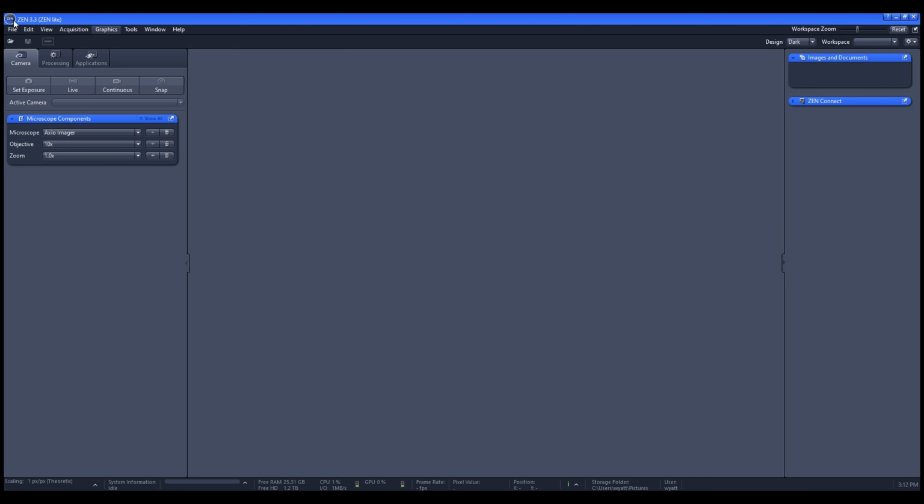As you can see, I'm now in this software, and I'm going to use it to show you some really cool thin section scans from some of my rock samples. Over the summer I collected some mafic samples like basalts, which are extrusive volcanic rocks from a volcanic field in Montana. I collected these samples for not only geochemistry and isotopes, but also some thin section analysis to do some petrology, essentially.